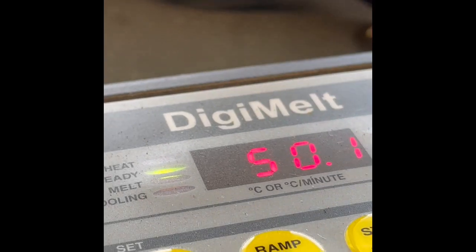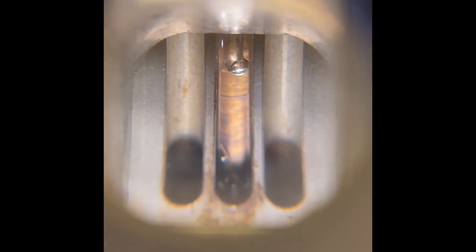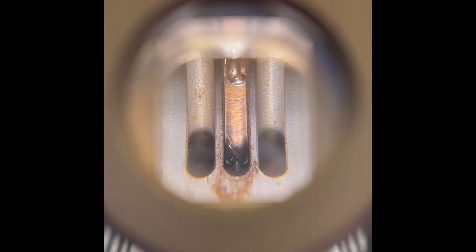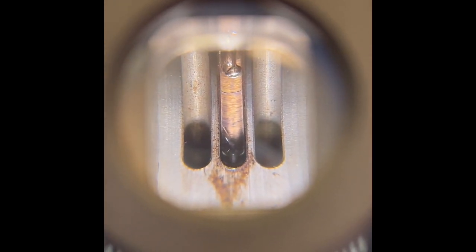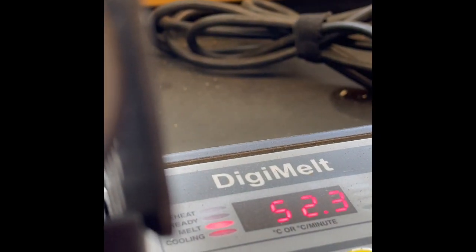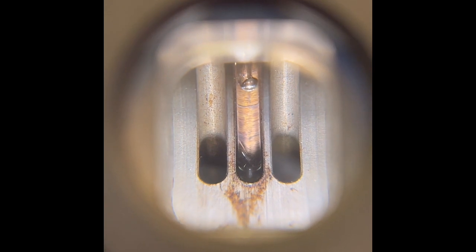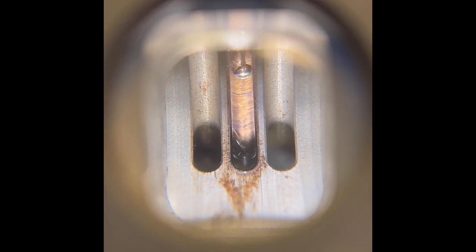I started it at 50. It says ready. I'm going to click melt. So what we want to do is just pay attention, see what's going on, right? So we want to start noting when we see bubbles, and then basically record all of your observations, because you have no idea what you're looking at right now, for this is the first time you've ever done this, right? It's kind of like you get half credit too, because I'm doing it. But right now we are at 52. So what you want to do is look for little micro bubbles coming out of that capillary tube. And then once they start to bubble, we'll go ahead and just kind of keep an eye on that temperature.